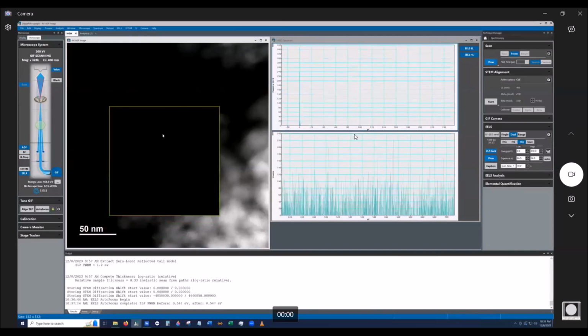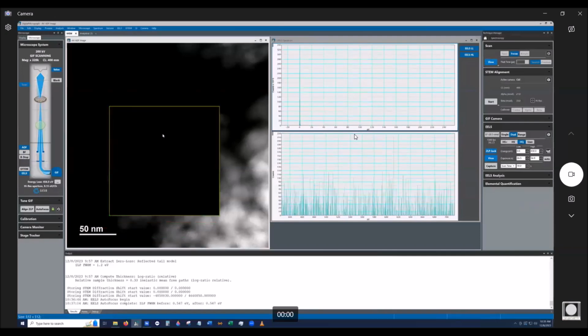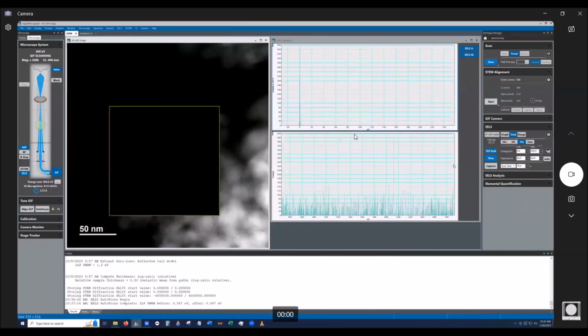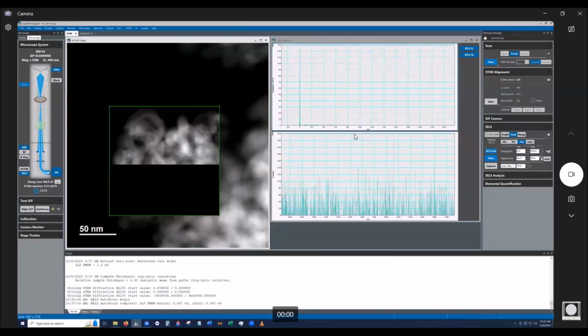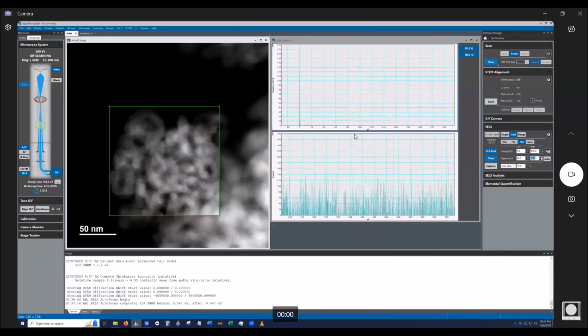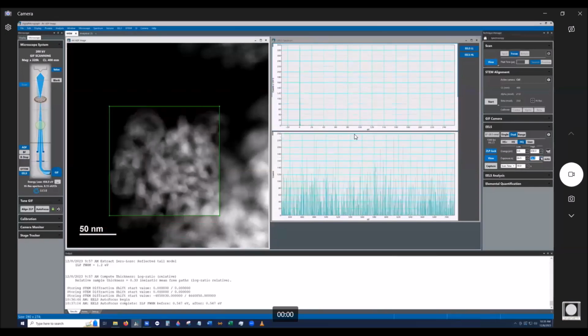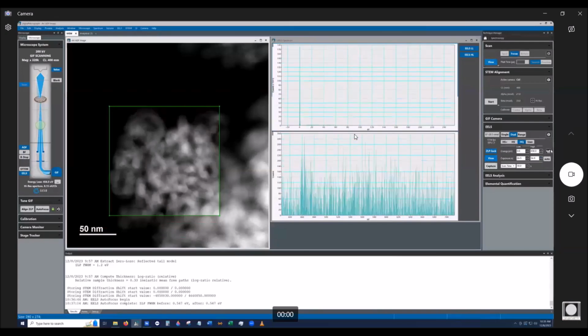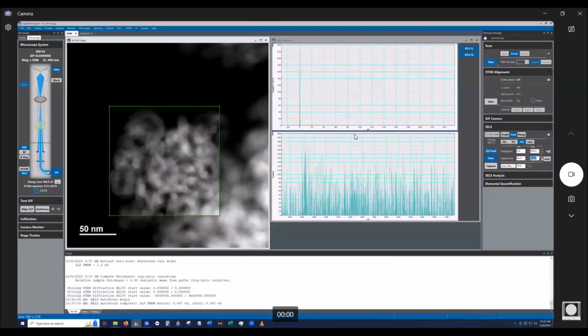And if I push up arrow, that's going to increase my dwell time. Okay, and then I'm over here, I'm going to increase my exposure time for my high loss till I start to see my titanium. Yeah, so we can start to see it coming in there. It's my titanium core loss edge. Yep, there we go.